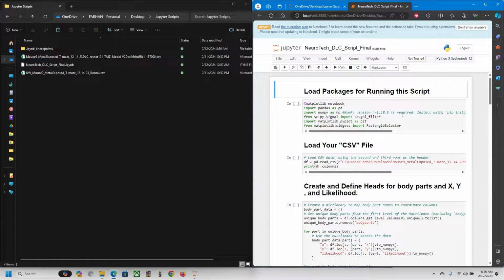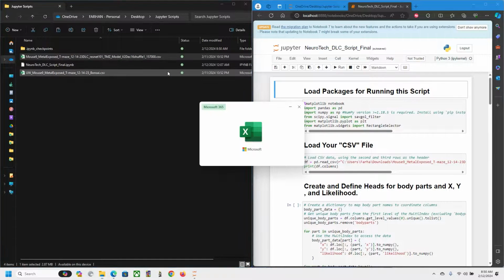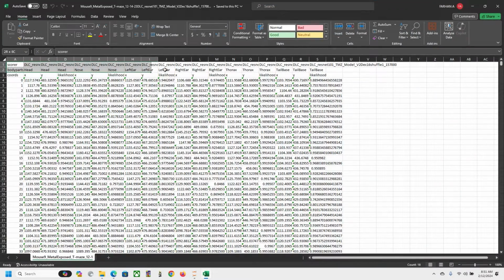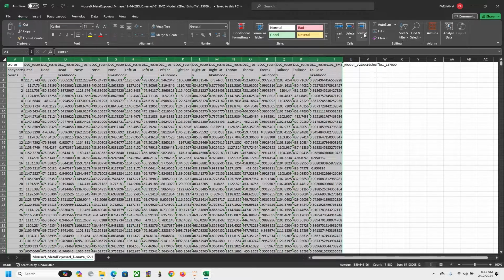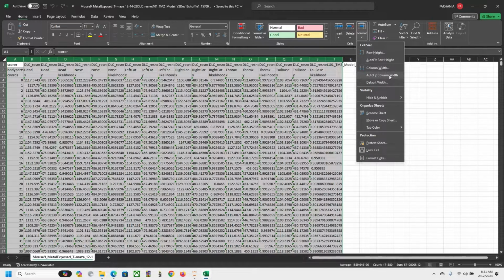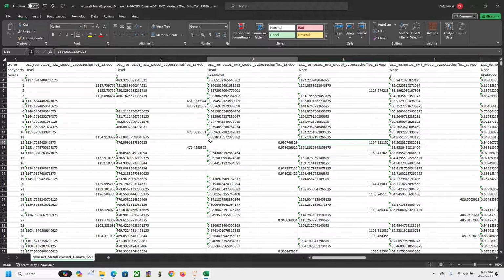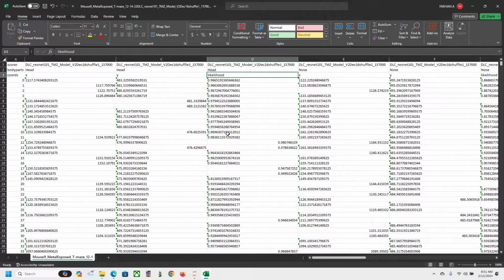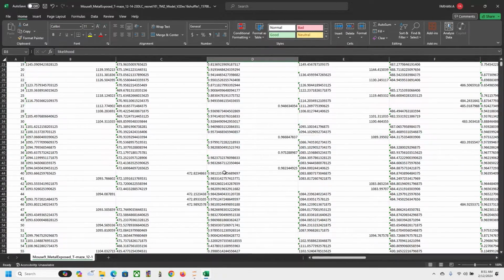Hi everyone. In this video, I want to quickly cover how to analyze your DeepLabCut CSV output files. In my previous videos, I've been showing you how to analyze behavior videos with Bonsai. But here I want to recognize the fact that CSV outputs from DeepLabCut are extremely helpful and speed up the analysis process. To do that, I want to quickly cover a few things. When you get your CSV output from DeepLabCut, it will look something like this.